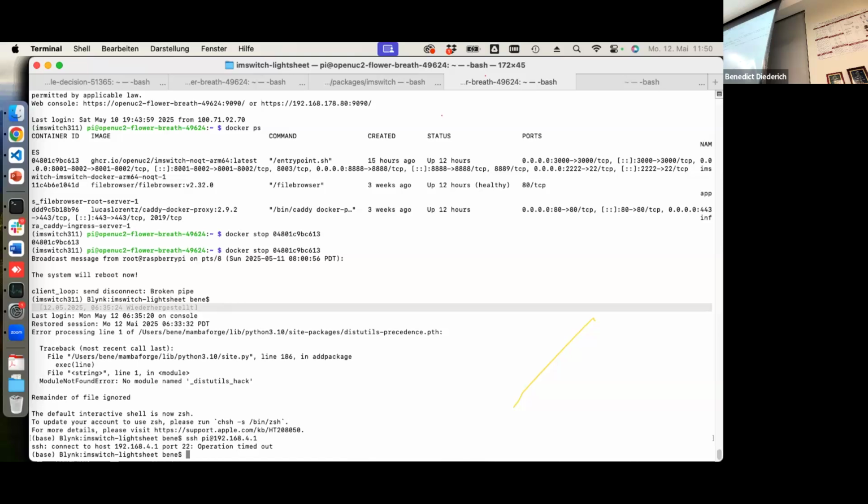So you have a certain. Okay, so the way it's of using your. Do you do the side? Well, it's normal sliding things. Are you doing the same thing?